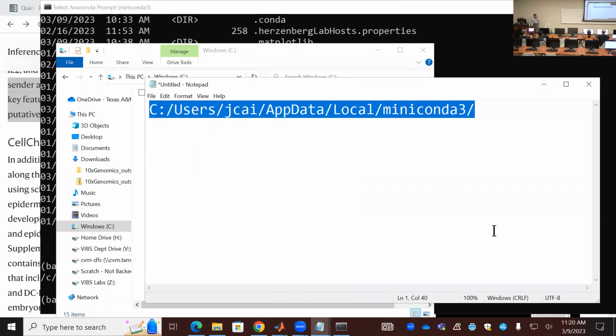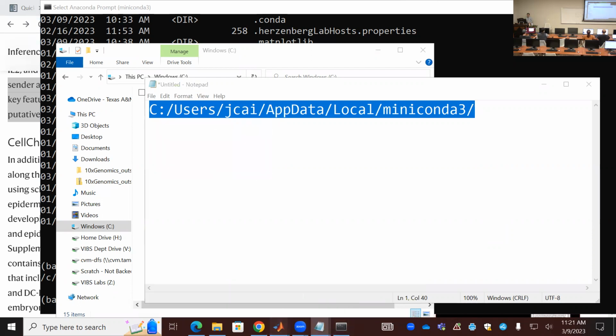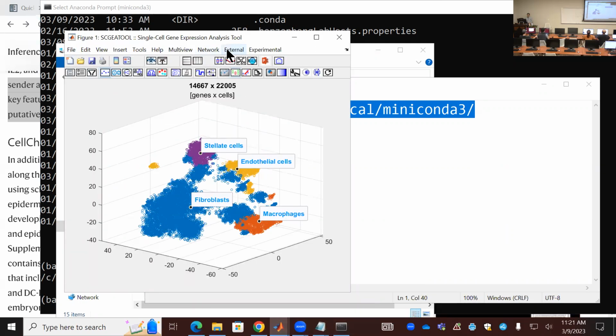But in some systems, this app data is not visible. On my machine, my office, normally you should have this visible. But on this machine, I don't know why, your profile and your app data has been hidden and become system level. But I'm going to try this. Identify where this Python command is located.